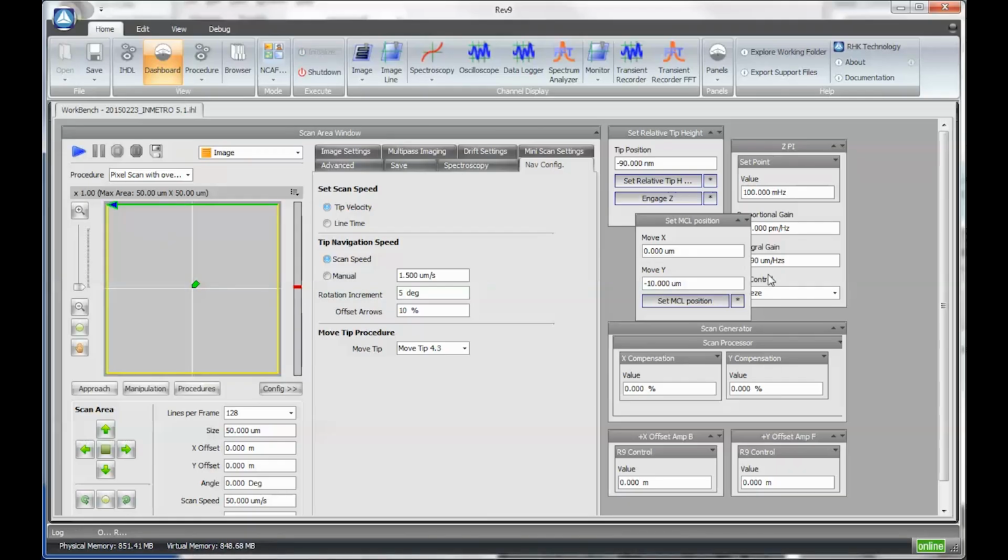Alrighty, so I've initialized, and I ran the procedure a few times and realized I had a small little bug in it. So we have a scan coordinate here, scan system, and the motion I'm doing, I want it to be relative to the existing rotation. However, that particular one that I did not.